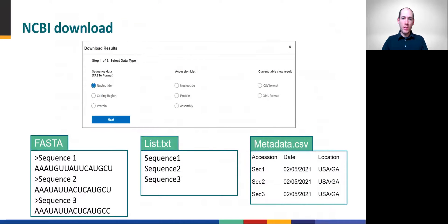Like GISAID, NCBI allows downloading the selected records in a few different formats. Download the consensus viral genome sequences in standard FASTA format for analysis with many phylogenetic software tools. NCBI also allows downloading only the annotated gene or predicted protein sequences, also in FASTA format. Or download a list of selected accession numbers to share with your bioinformatics colleagues, or download a comma-separated metadata table with specimen information similar to what's shown in the table used for making the selection.